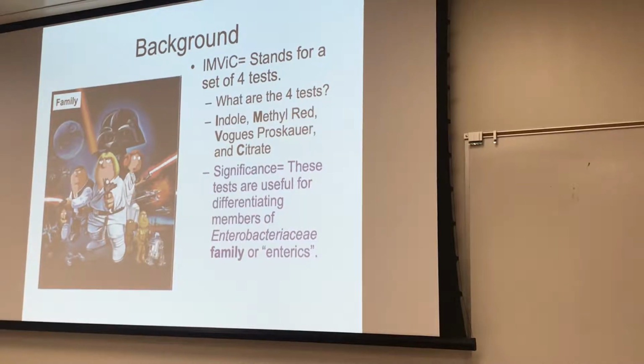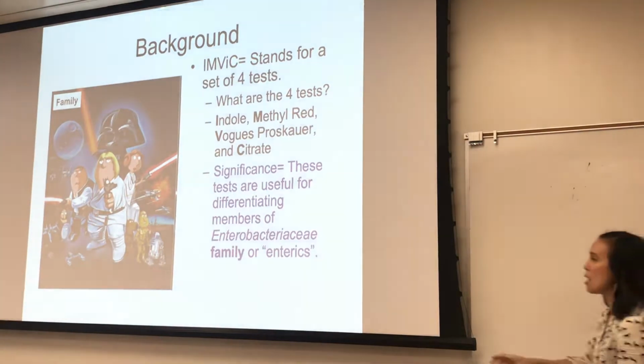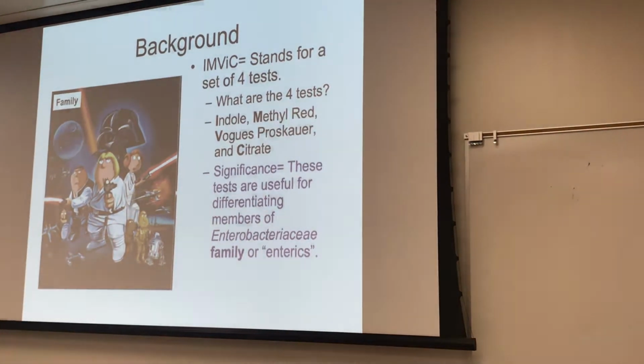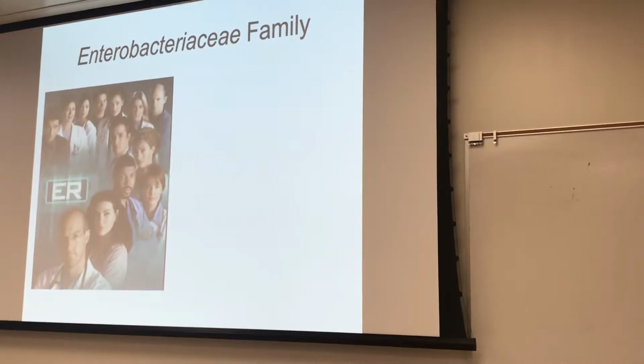Out of all the labs that we've done, IMViC is probably one of the top sets of experiments that'll help you, especially if you think you're in the family. If you're not in the family, it probably won't be as helpful, but if you are in the family, then it's going to be really helpful. So, all right, and then I think we just have one thing left, and then we'll draw this out.